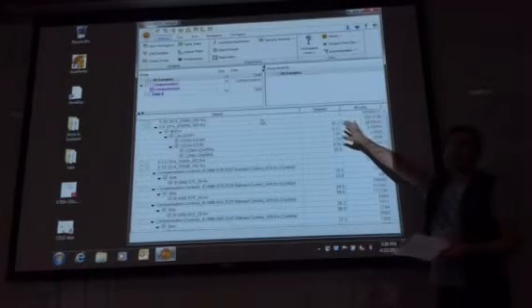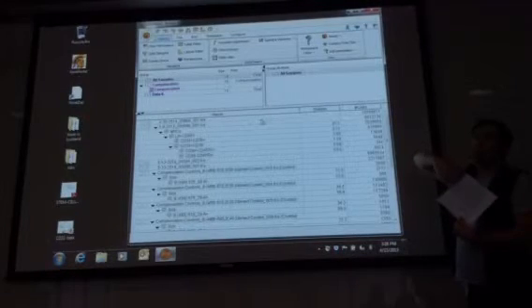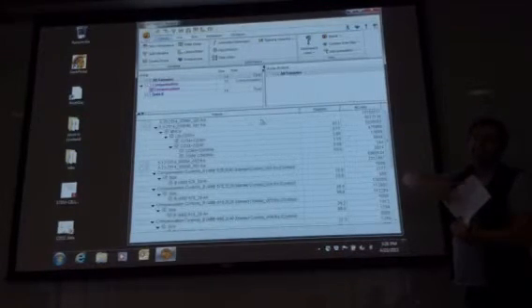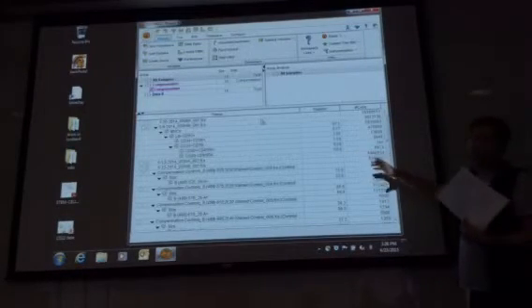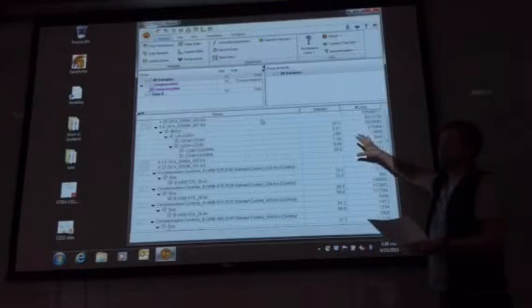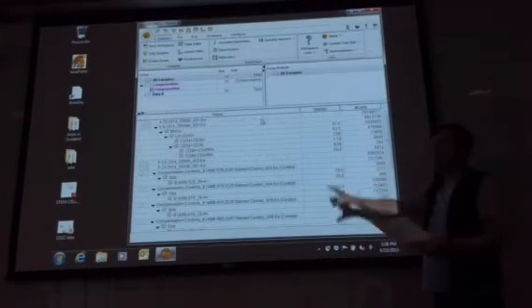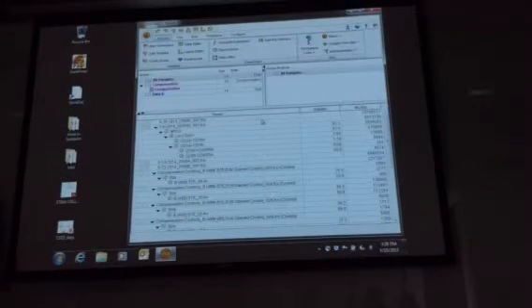It's taken from actual cell samples, where the postdoc in my lab, Xiaoying, actually went through this and did exactly this on all of the data. So it's not just an exercise we made up for you guys. This is something that we actually did, and you will hopefully be able to see the variability that exists between different collections of cells, and try to identify the frequencies of stem cells in it.